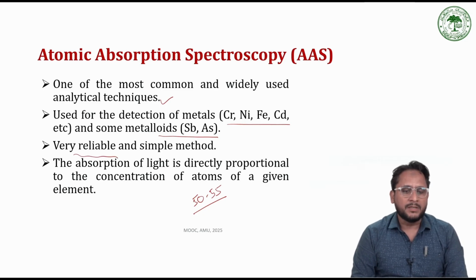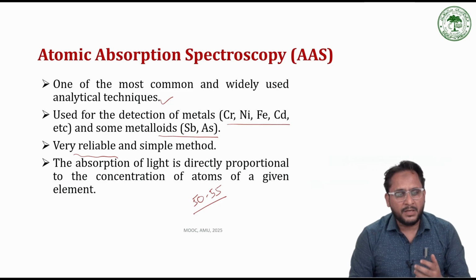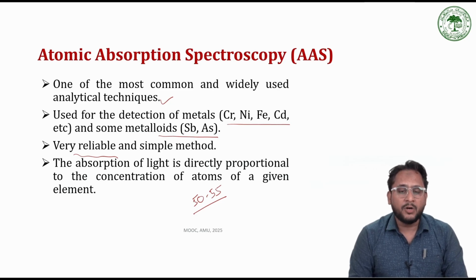The light which is being absorbed, or I should say the amount of light which is absorbed, is directly proportional to the concentration of atoms of a given element present in the vaporized state.